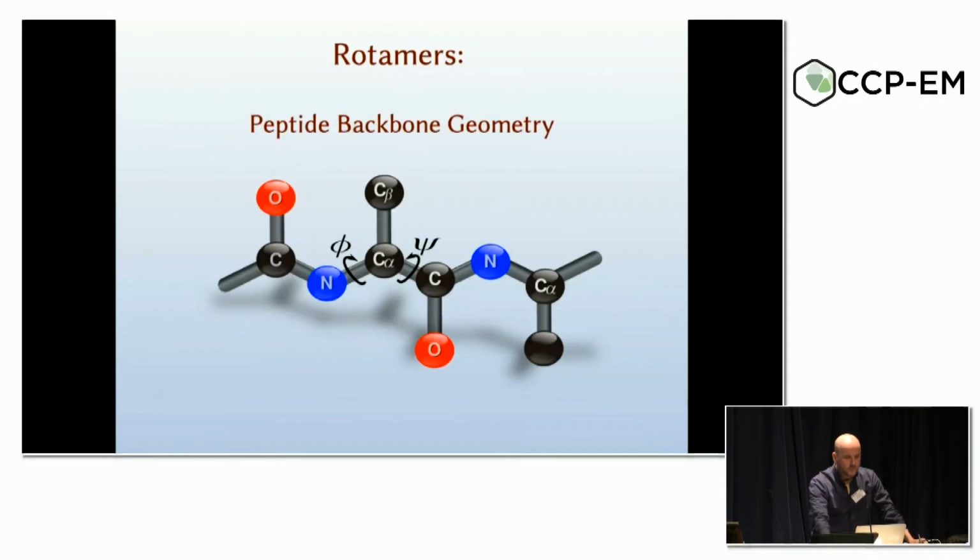Okay, so previously, Coot had a naive or high resolution, they're the same thing these days, interpretation of how to do model building of rotamers. And what it did was it cut up the atoms that were being fitted into residues. So it made a cut along the peptide bonds. And it said, I'm going to fit these, but not these. Now, of course, that turns out to be naive.